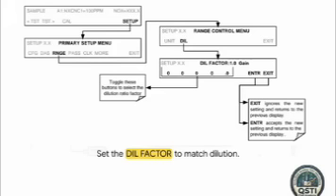Here, you'll just toggle the numbered buttons across the bottom of the display to match your precise dilution ratio factor. Once you've got that number dialed in to reflect your lab setup, you absolutely must press ENTR to accept the new setting. If you press Exit here, it literally just ignores your changes and reverts back, so make sure you lock that in.